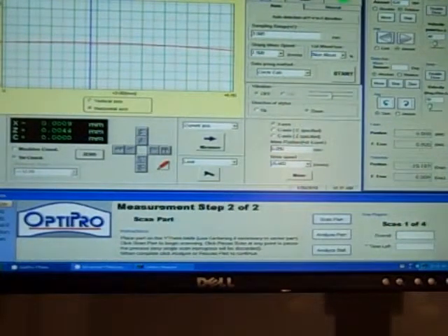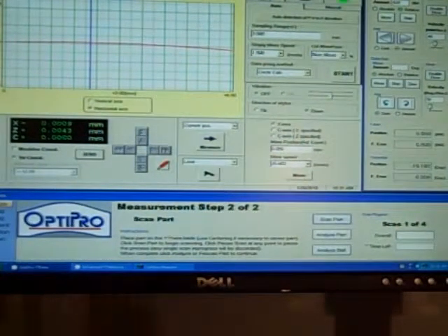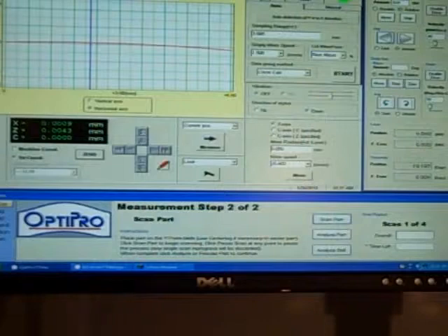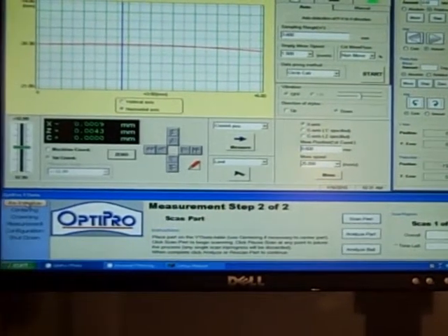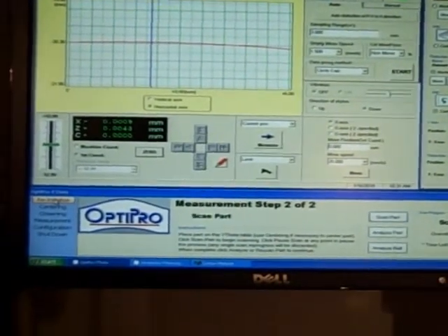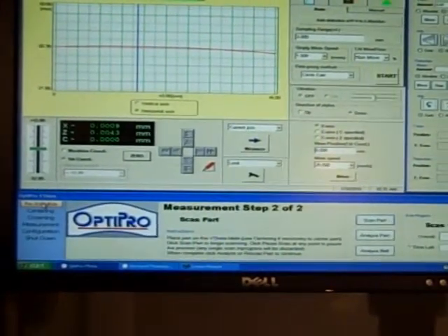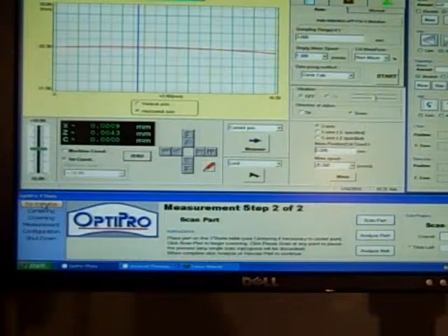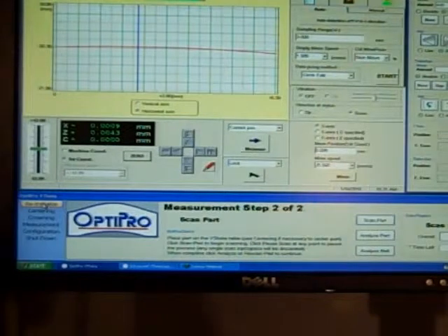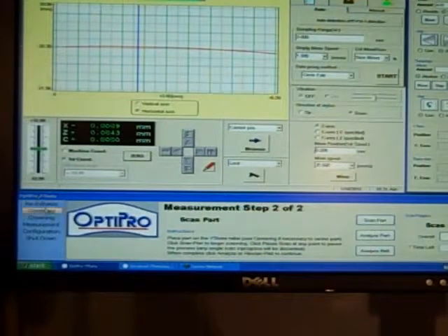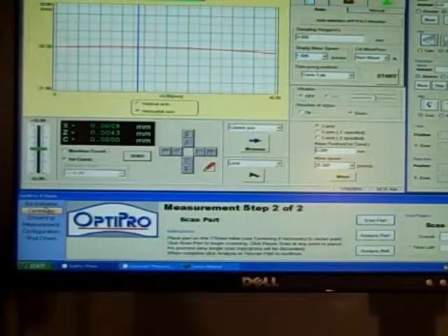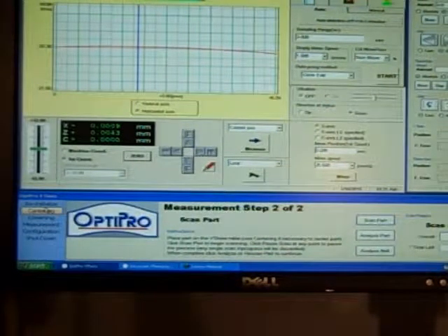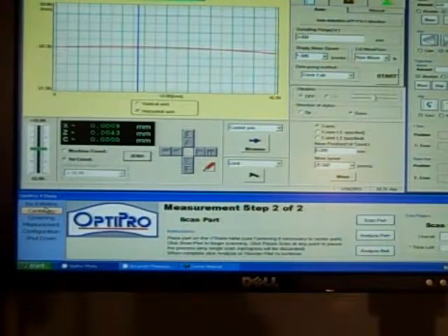The software allows you to automatically crown the optic as well as measure the optic. We have centering and crowning in the Y-axis as well as the X-axis.